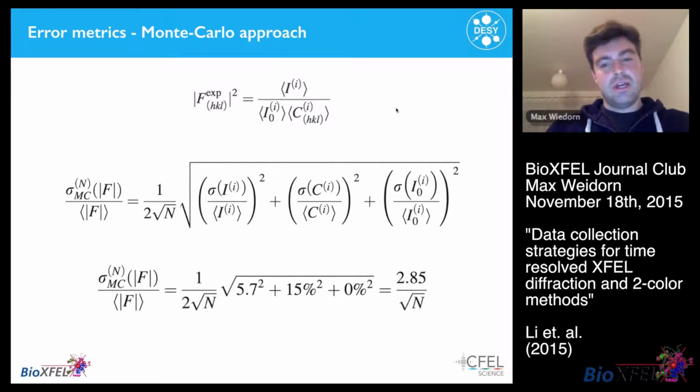So the authors chose the worst limit, or the limit going towards the worst side, using 15%, so that they end up with an error number that, as expected, drops with increasing numbers of shots.